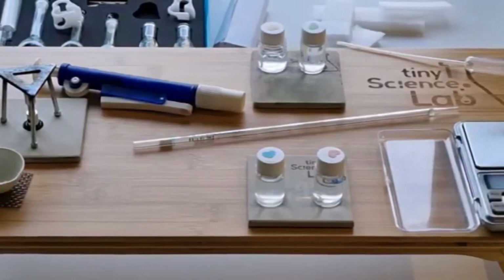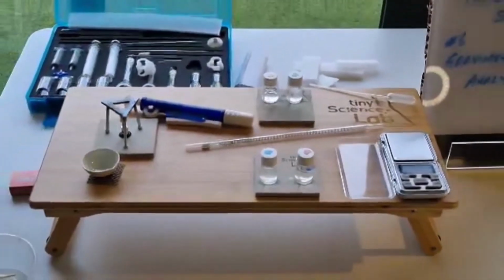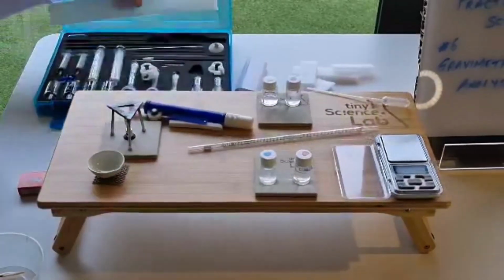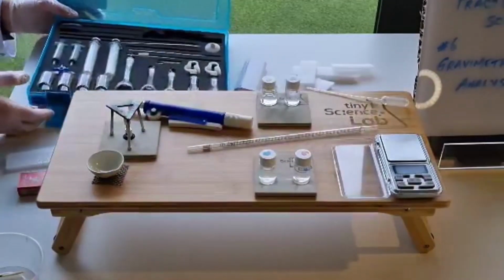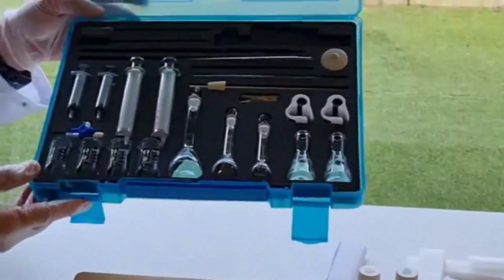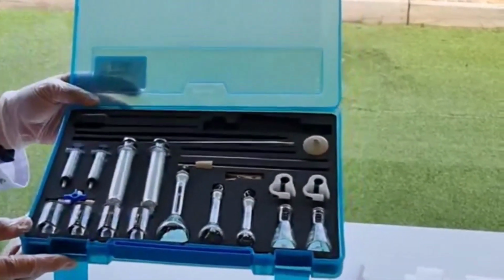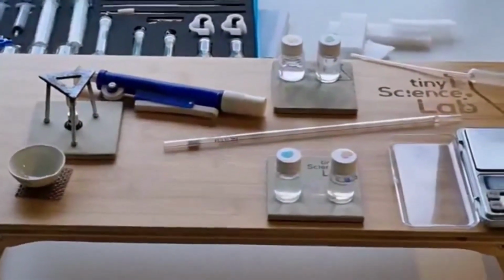We're going to take some samples of each of these, and one of the nice things that we're going to be able to do in this episode of Practical Science is we're also going to be able to highlight some of the magnificent additions to the Tiny Science chemistry collection. You can see some fabulous little volumetric flasks, a number of syringes, and an opportunity that we'll have here to do some important Year 12 chemistry experiments. But we'll have to save them for later on.